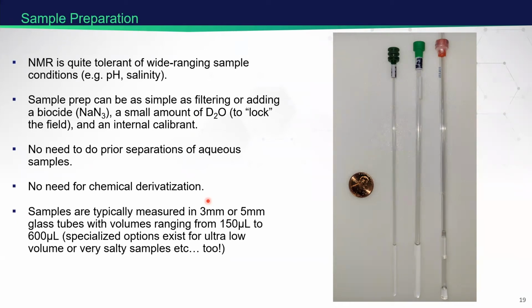We don't need to do prior separations of aqueous samples. There's no need for chemical derivatization. And if we're working with tissues or extracts, with the common techniques like MPLEX, we can take those samples and use them in solution state NMR, and we do that quite often as well.